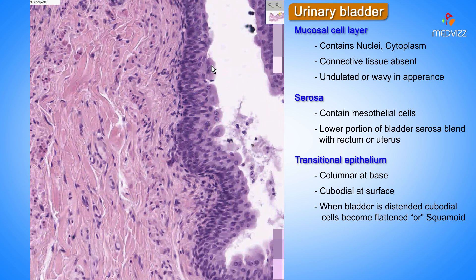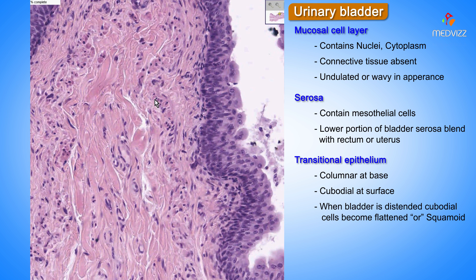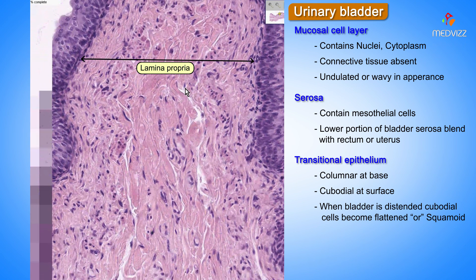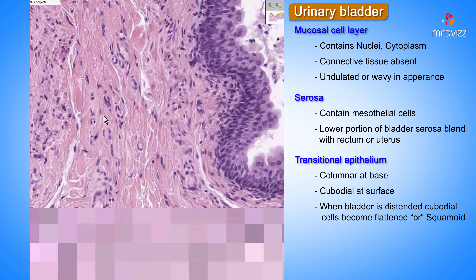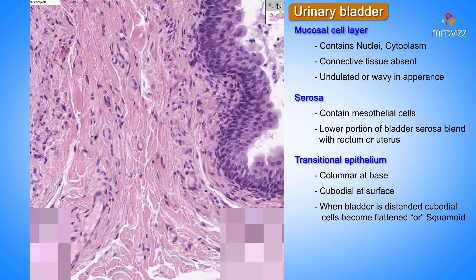That's why it's called transitional. In real life, the entire epithelium just described — or transitional lower urinary tract epithelium — is usually referred to, and now more often referred to, as urothelium. Notice we have connective tissue of the underlying mucosa, or lamina propria — I don't think it matters what it's called. Notice that there's a lot of collagen bundles in here.